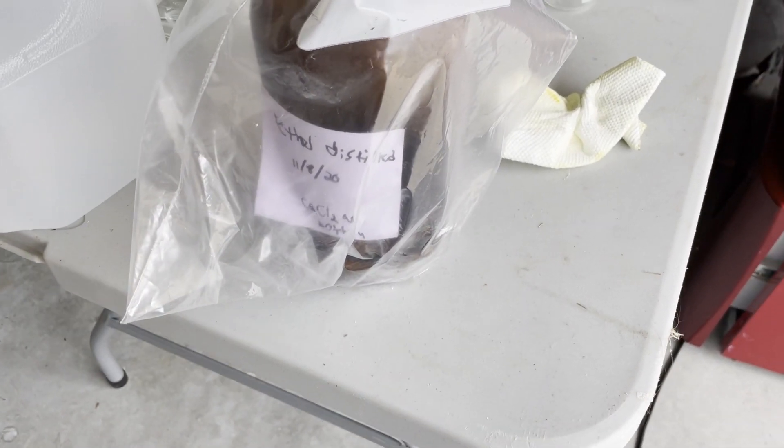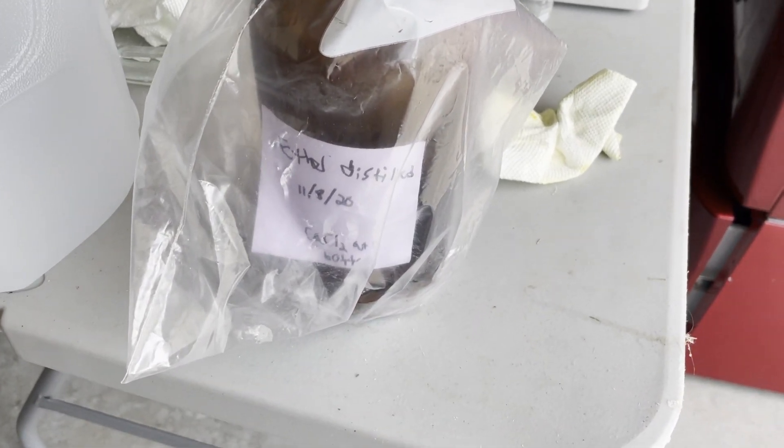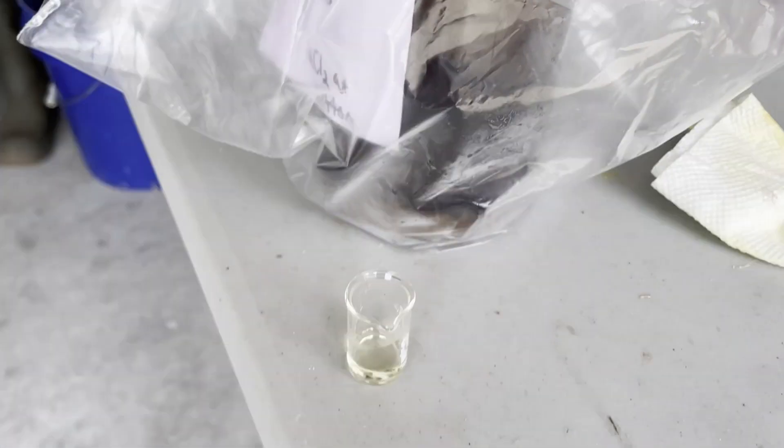So when looking for peroxides, I'm going to be doing the potassium iodide test. This test is when I dissolve potassium iodide in dilute hydrochloric acid and add some diethyl ether to it. If there is not a major color change, that means there are no peroxides present. However, if there is a major shift toward the color red/purple, then that means that there are a lot of peroxides present.